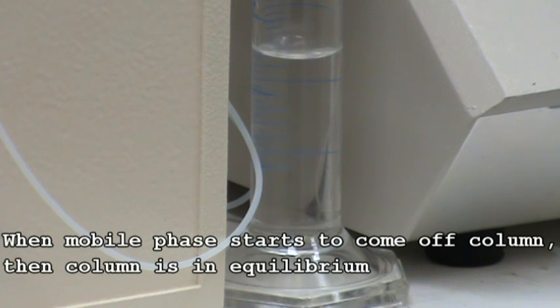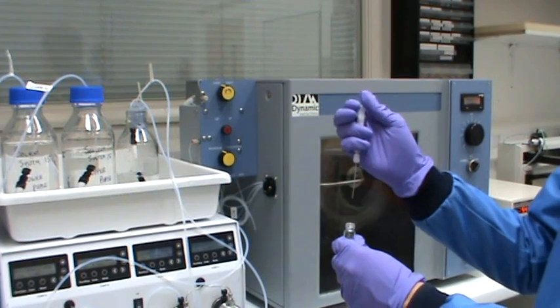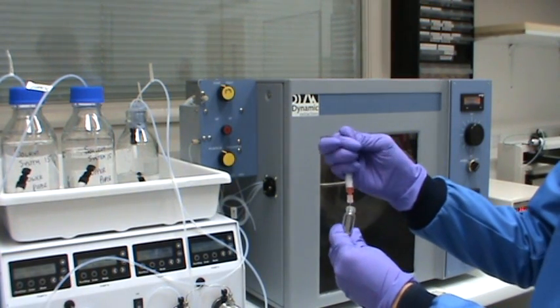This shows the column is now in equilibrium. In this case the mobile phase is the lower phase, so you can clearly see that it is now coming off the column. Your sample is now ready to inject into the HPCCC column.